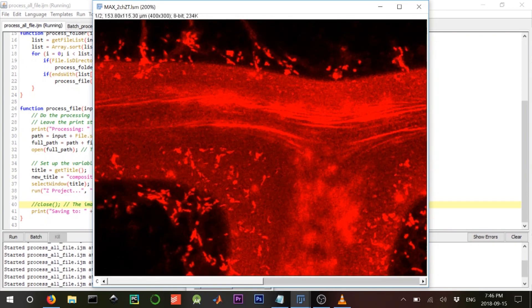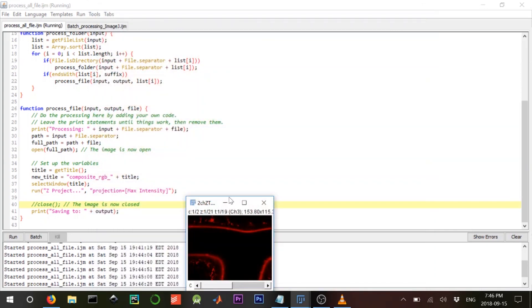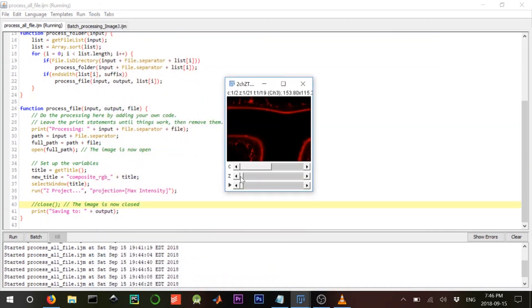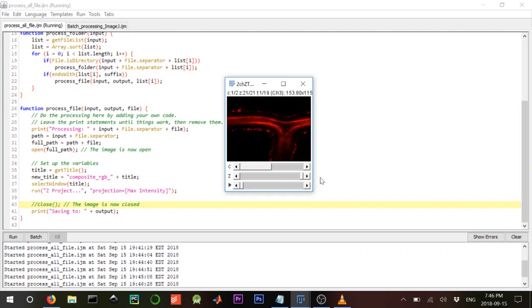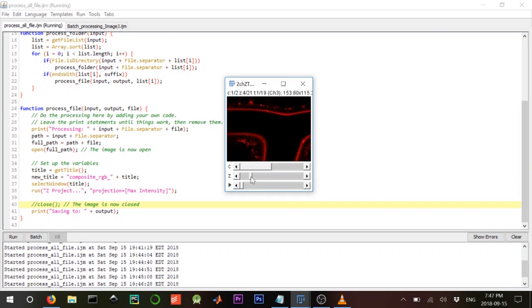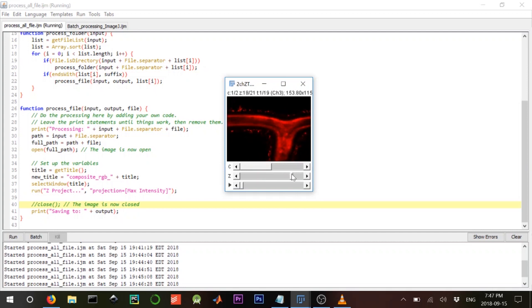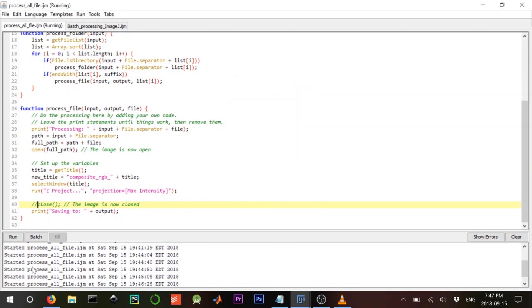We split the channels afterwards, but this is how you stack slices together. Maybe you don't want to stack all of them — maybe you want to stack from here to here, then from here to here, and from here to here. This is the problem we're asked to solve, so how do we do that?